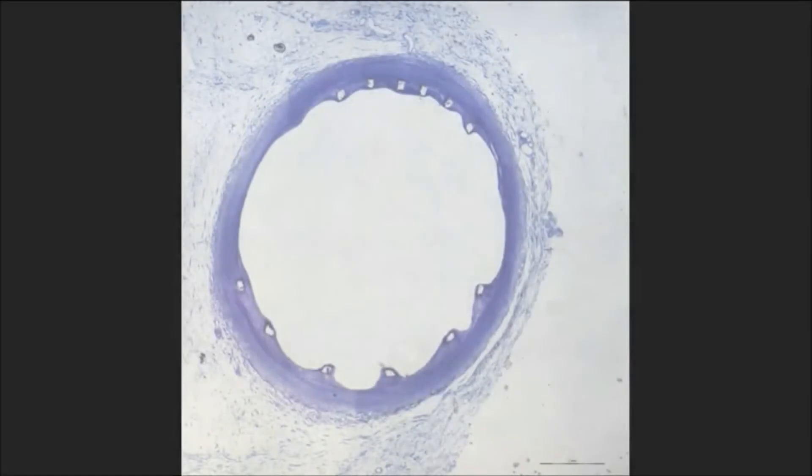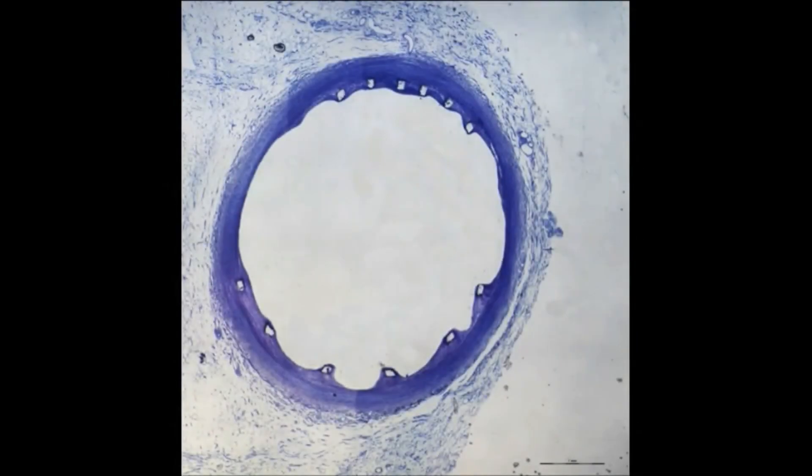In this way, non-decalcified hard tissue sections and sections of samples containing implants may be prepared as thinly as 10 micrometers. Serial dissections are also naturally possible.